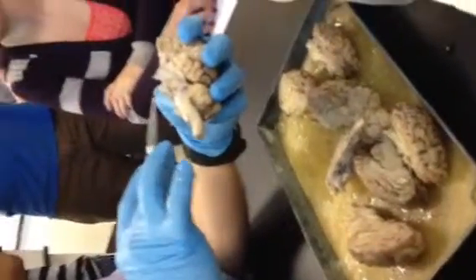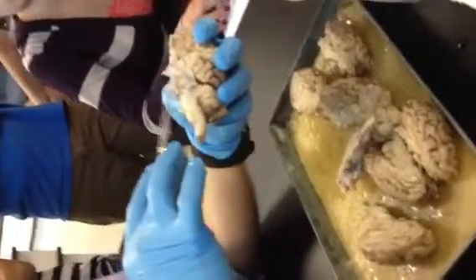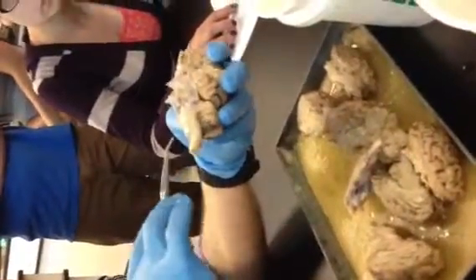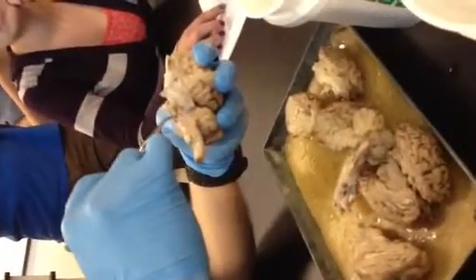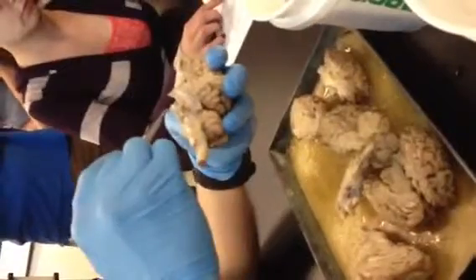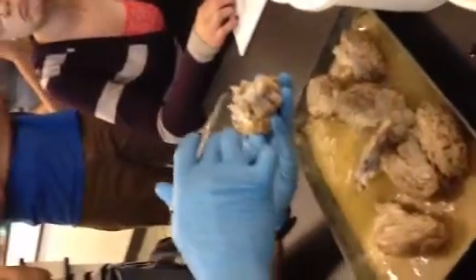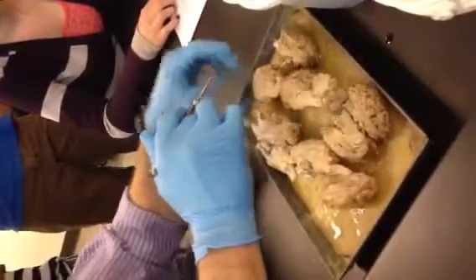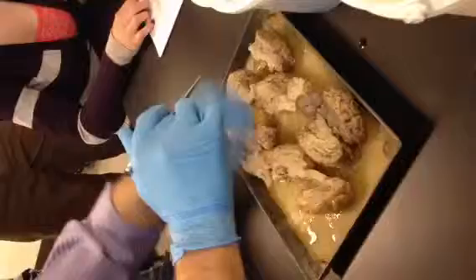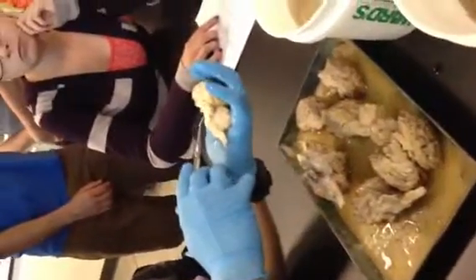But the best way to do this is just to tell you that the pituitary gland has a stalk that connects it to the base of the brain. When you pop off this dura mater, you usually pull the pituitary gland off with the dura mater. So that's why it's still intact here, but if you look at most of these from the mid-sagittal cut, like this one for example, there's no more pituitary gland here.